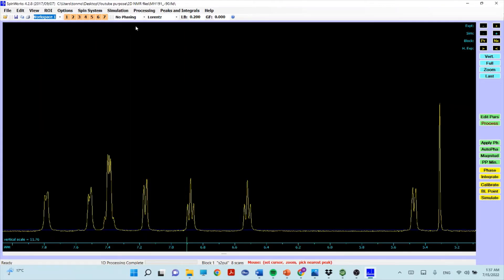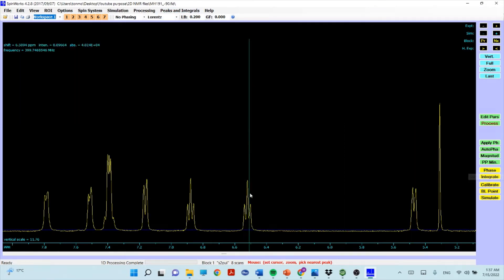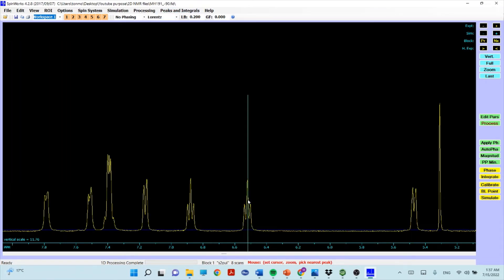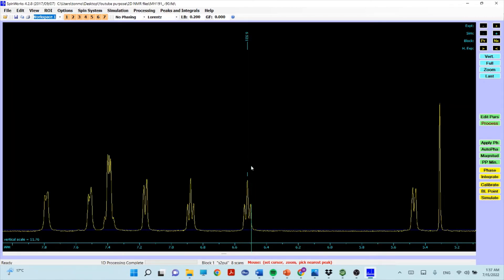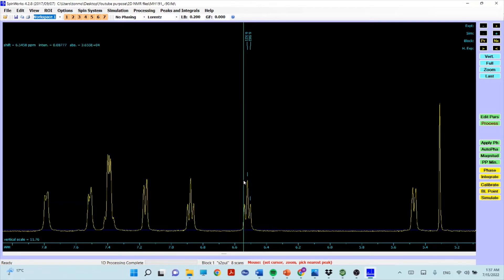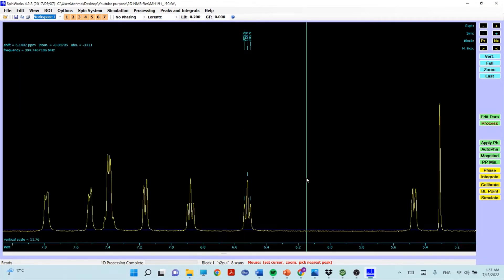For 1D NMR processing, if you want to display peak values, click on the peak and then right-click your mouse. You'll get the peak label displayed. Right-clicking at any peak position will give you the peak value options.